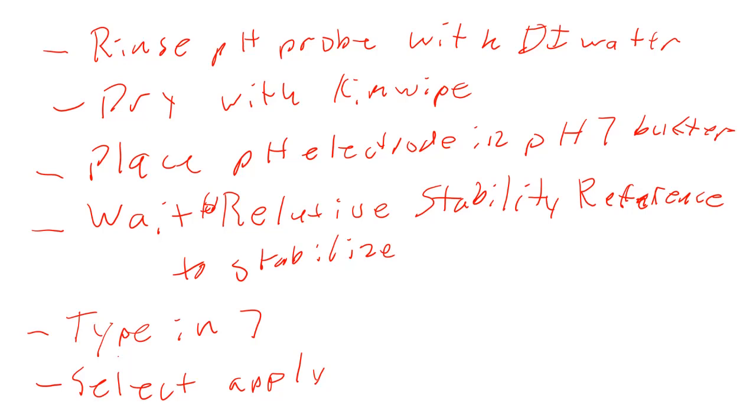So then you're going to do several experiments where you add 5 milliliters of the 0.10 molar solution of the sodium salt, which is the conjugate base of your weak acid, and you're going to see what happens to the pH. So let's walk through the calculations that you will need to do.